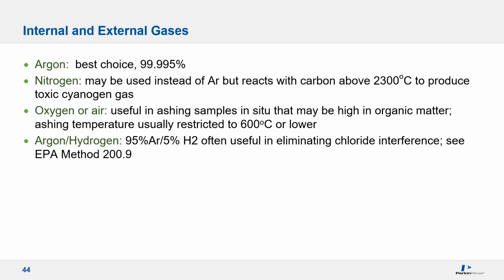sample causes a buildup of carbon on the tube platform that will significantly begin to alter the kinetics of heating. Note that you are limited in the maximum charring temperature or oxidation and degradation of the tube will begin to occur. Because of its potential applicability, let's take a much closer look at argon hydrogen as a mixed gas and its implementation in EPA method 200.9.